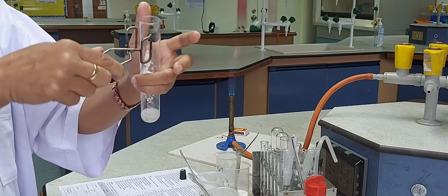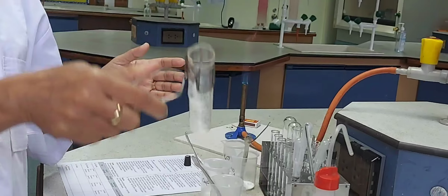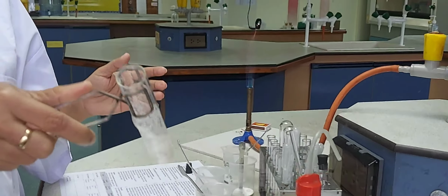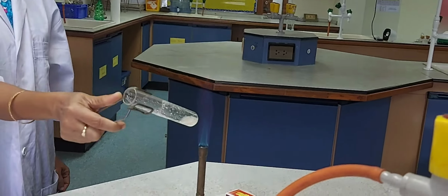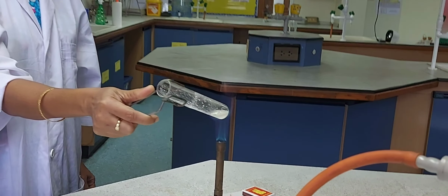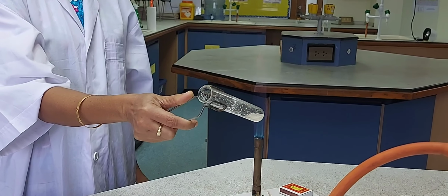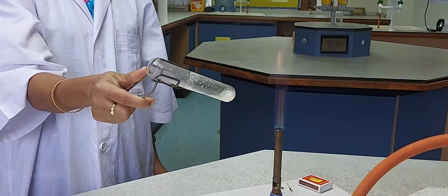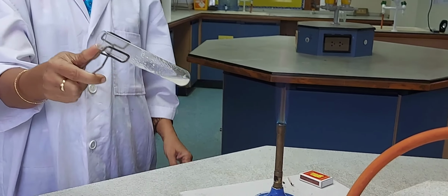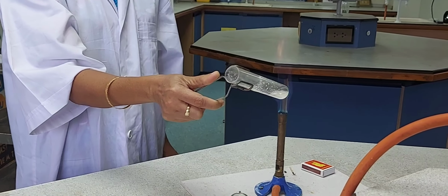So there is a slight bubbling, but there is no evolution of any gas. It's just that the calcium hydroxide is dissolving in the acid, and then on slight heating, you can hear a crackling sound as it is getting warm, and you can see the vapors of water being given out.